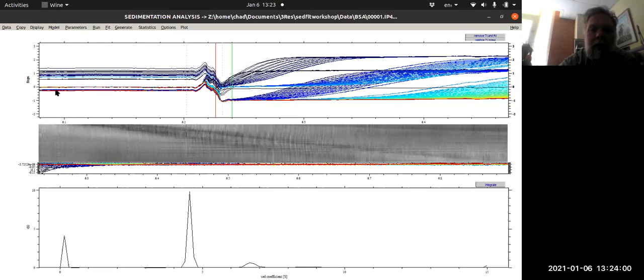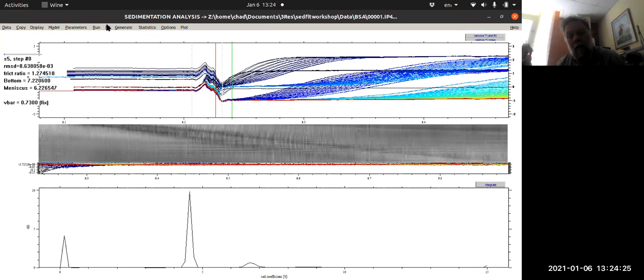Out here is crazy land. The meniscus is not here. The meniscus is somewhere here where all of this crazy looking data is. So I want to force the algorithm to pick a meniscus position that best fits the data, but actually sits somewhere around here. I might actually scooch this a little bit to the right, but sometimes when you're doing the fit, the meniscus position will run into one of the limits and it will just stop. That's usually a bad sign, and you want to open up the limits on fitting your meniscus position and go back and refit it, which is what I'm doing now.